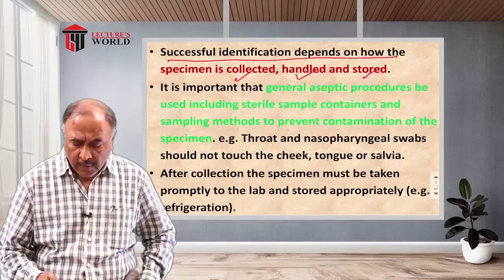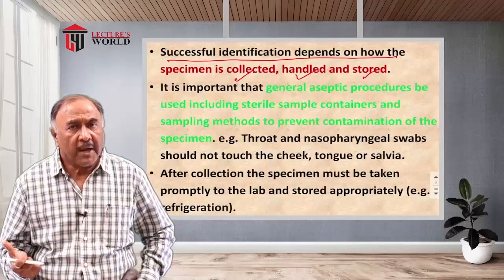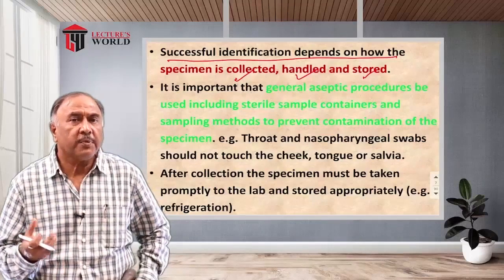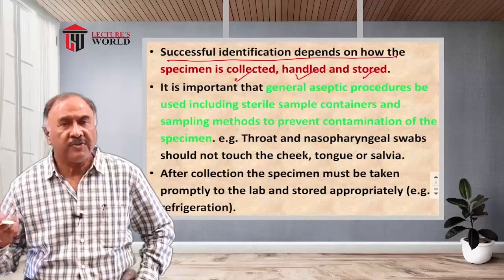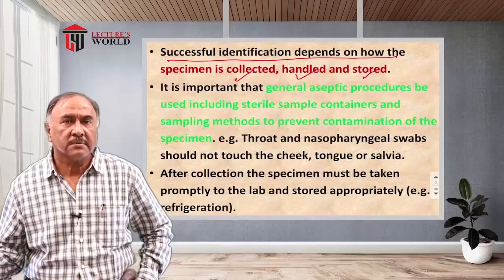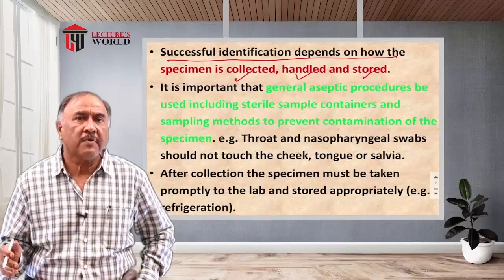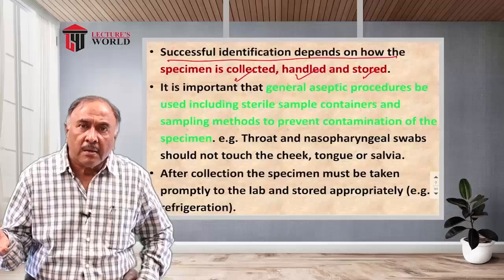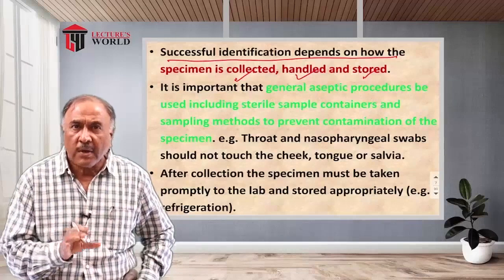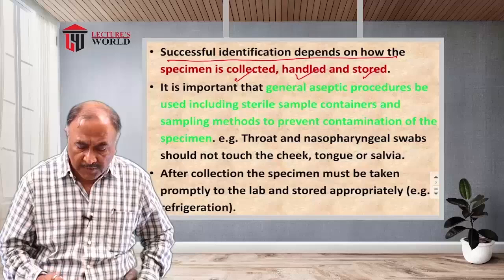So, you can come to know about the morphology of the organism, and by careful observation, you can come to know what can be the provisional way which we are going to follow in the second stage, that is cultivation. What kind of media we would require, what kind of process we will follow, that you can determine primarily on the basis of microscopic observation.